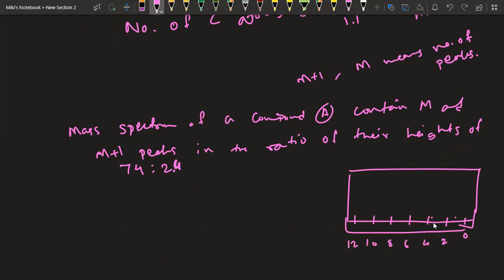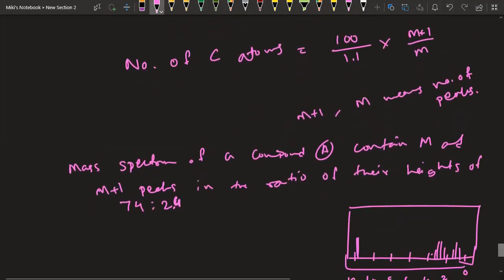Now we have somewhere here at the 12th position a singlet, and we have a quartet over here, and we have a triplet over here. Your duty is to find, using these formulas and these possibilities, what the structure is. Okay, your homework is this one.